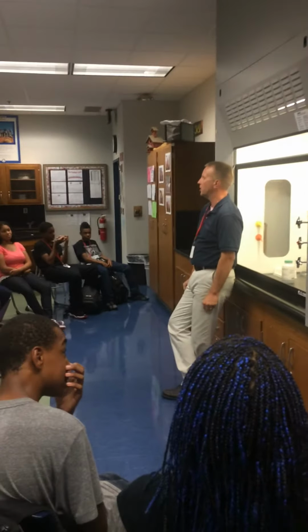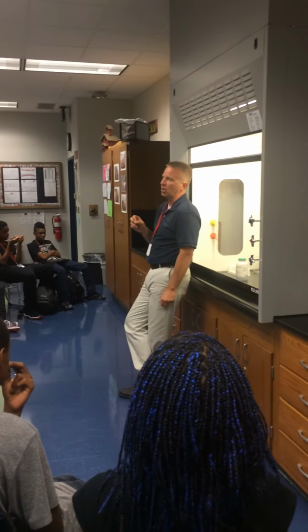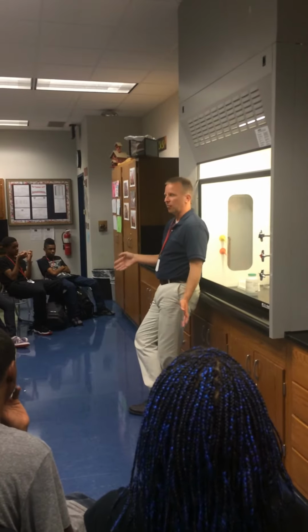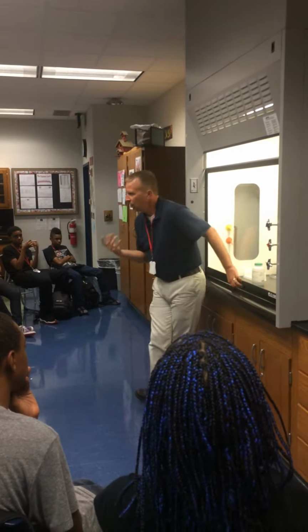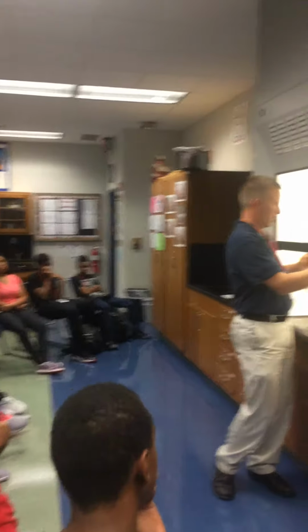What we're going to do today is I'm going to show two demonstrations. The first demonstration uses something that all of you are very familiar with, and something that you're not familiar with. The first thing I'm going to show you is the stuff that you're not familiar with.